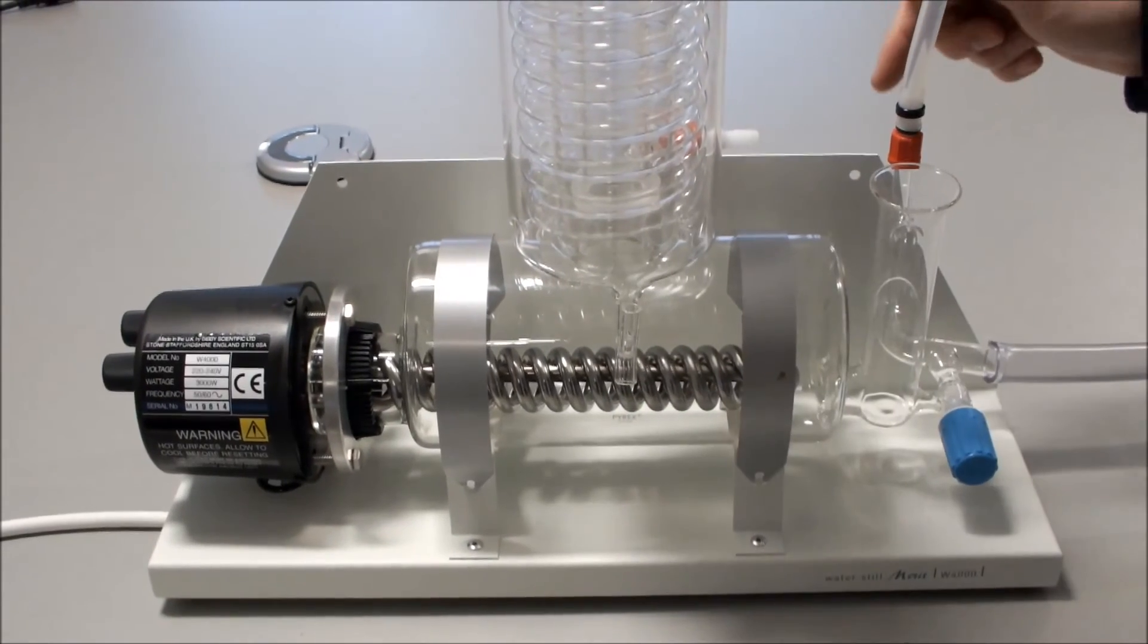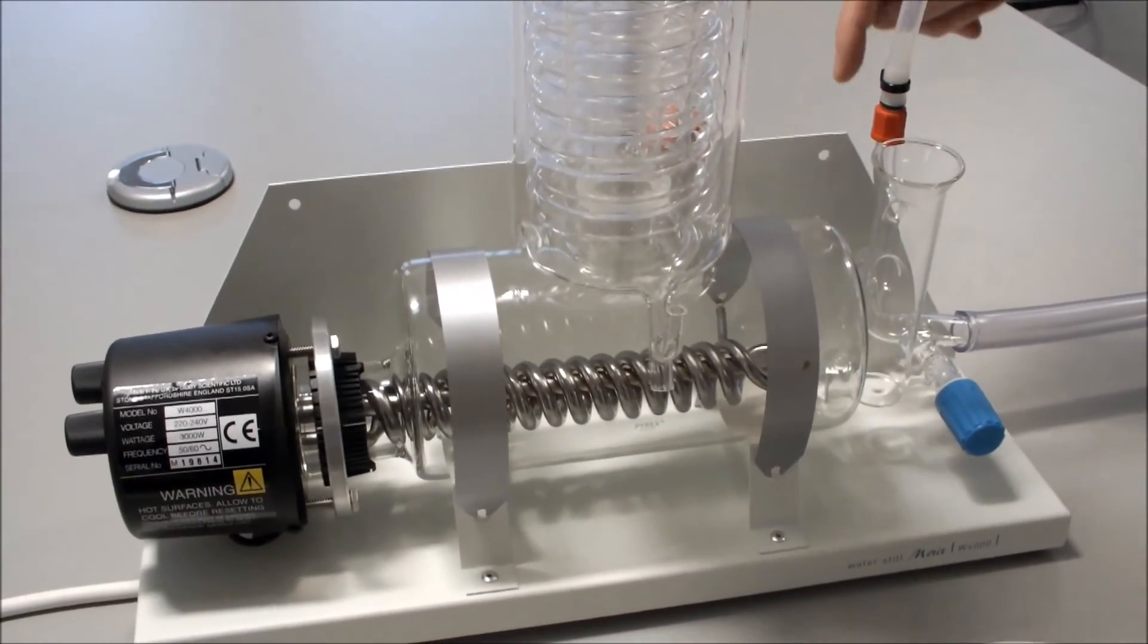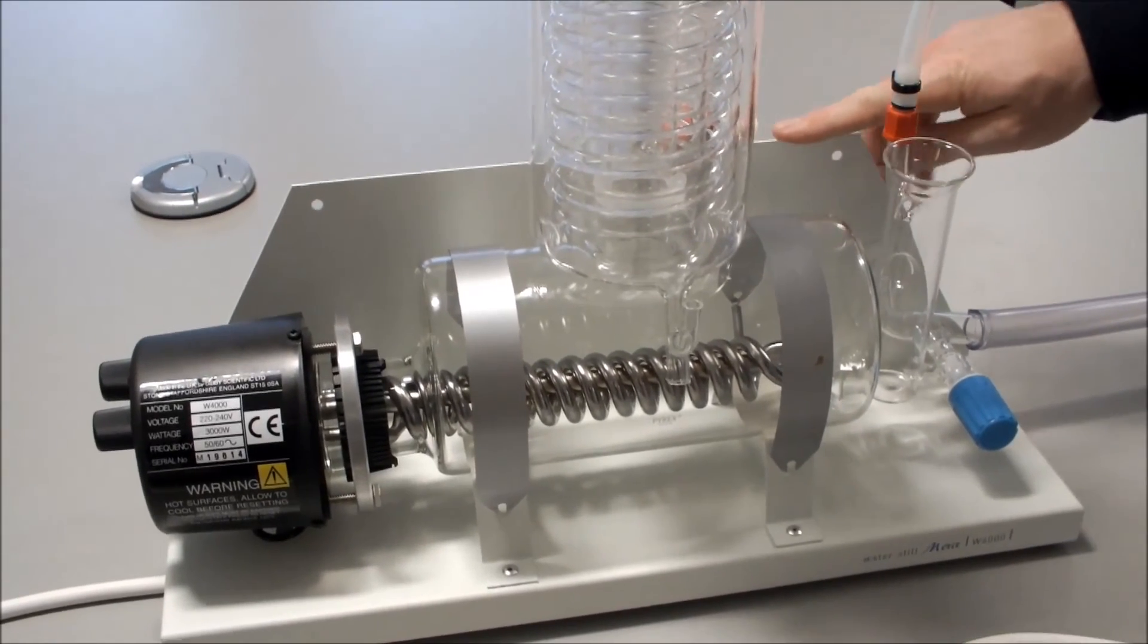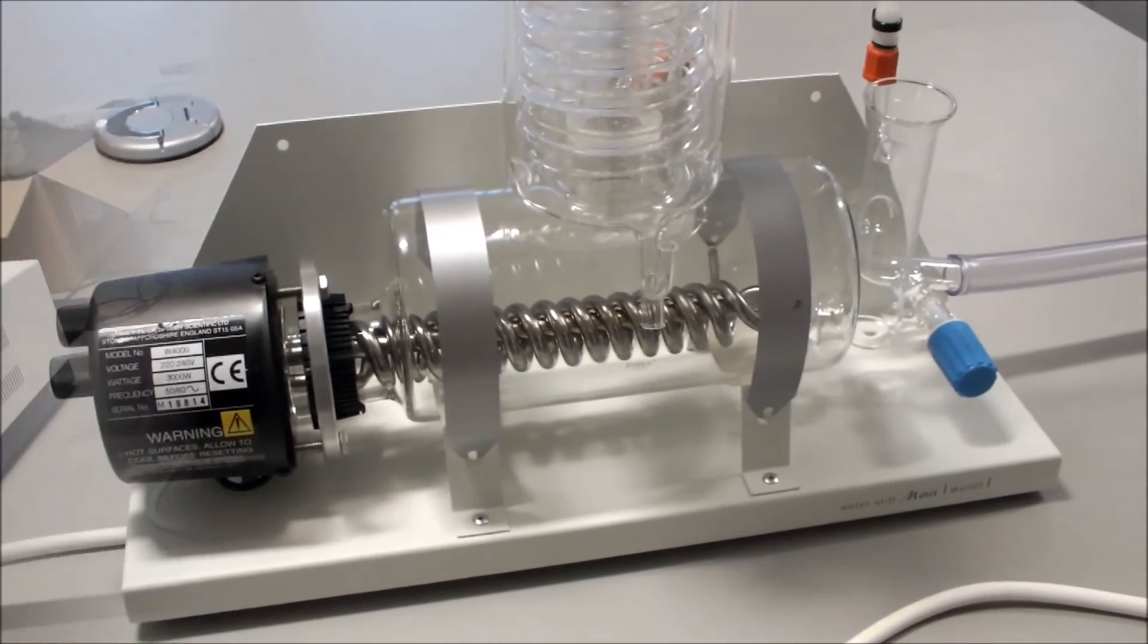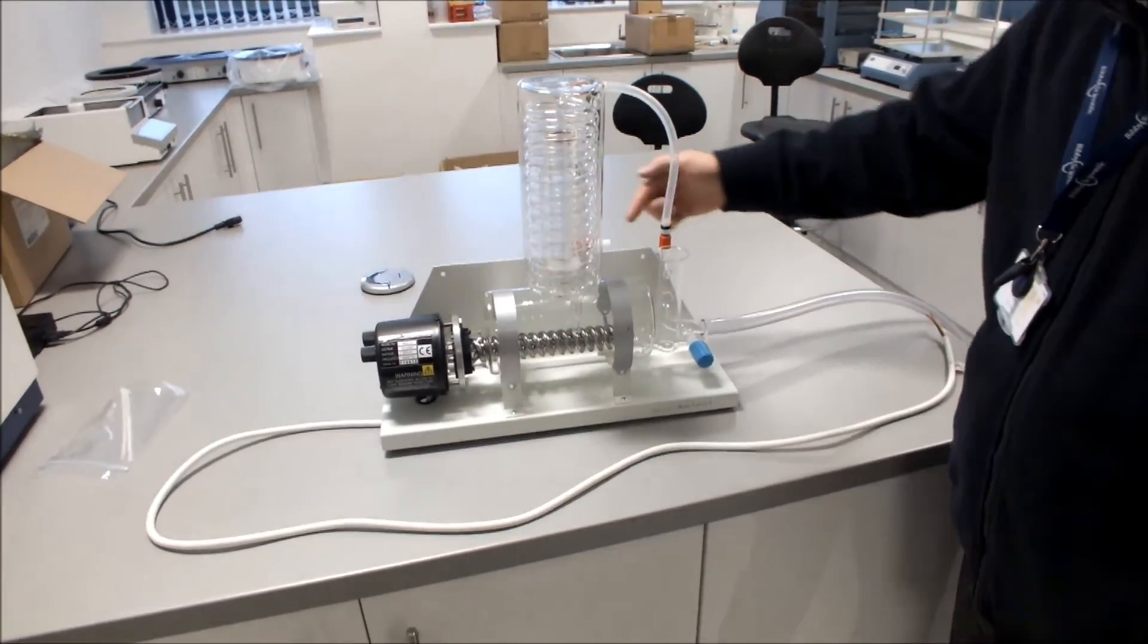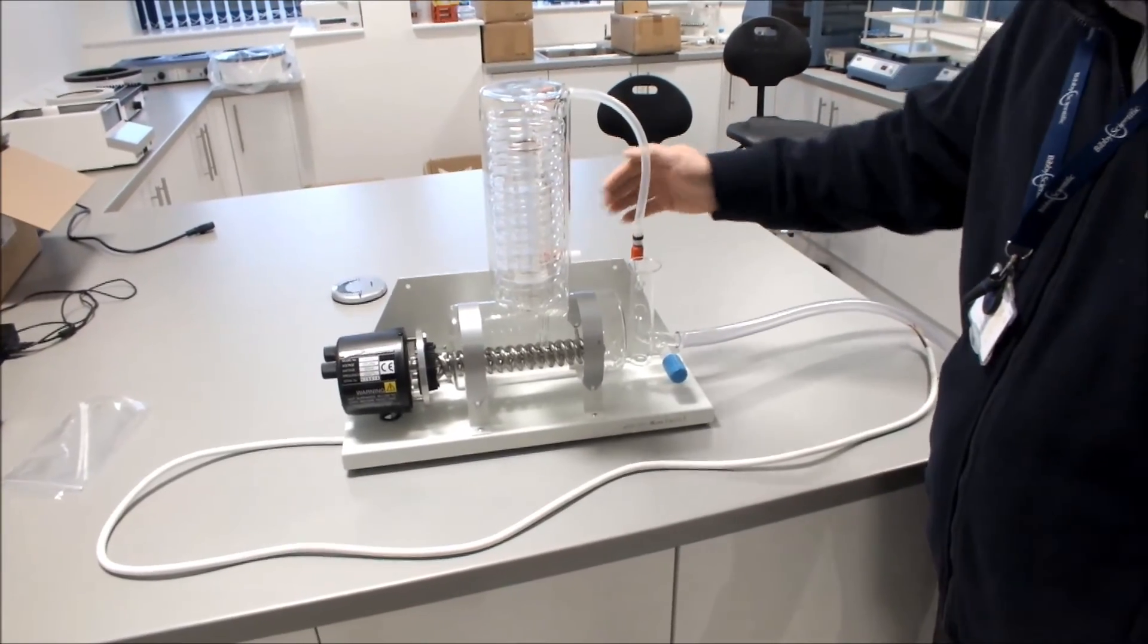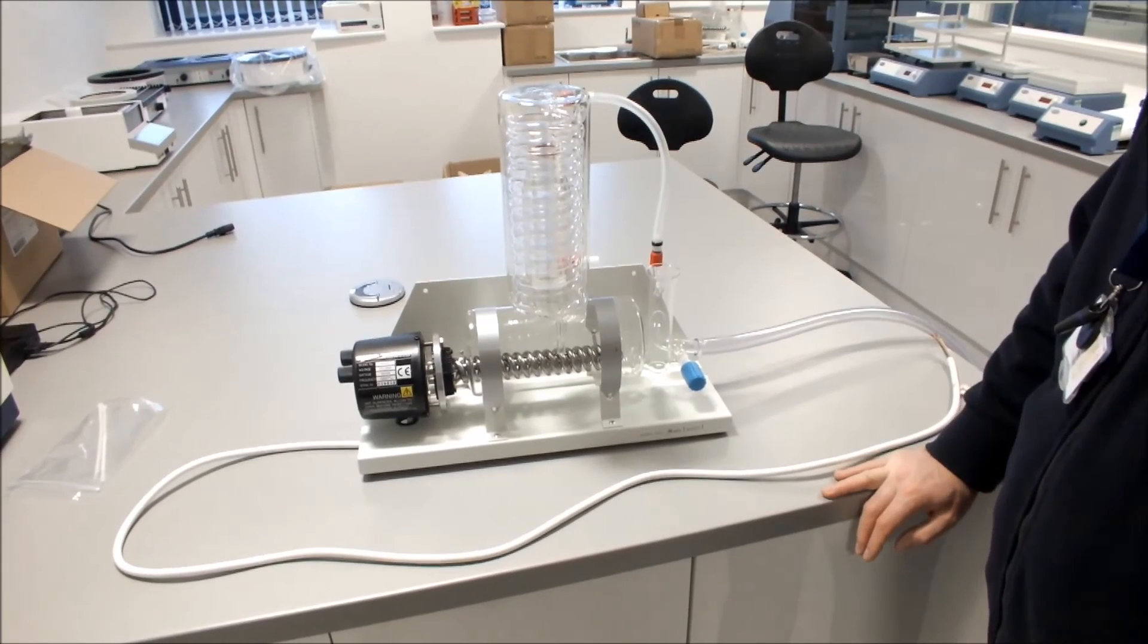Connected your drain, you can then choose the location of your water still. The water still can be wall mounted and there are two wall mounting holes provided. When we have our water still fully complete, connect your cold water supply. Turn the cold water on, let the water run through and you can check for any leaks.